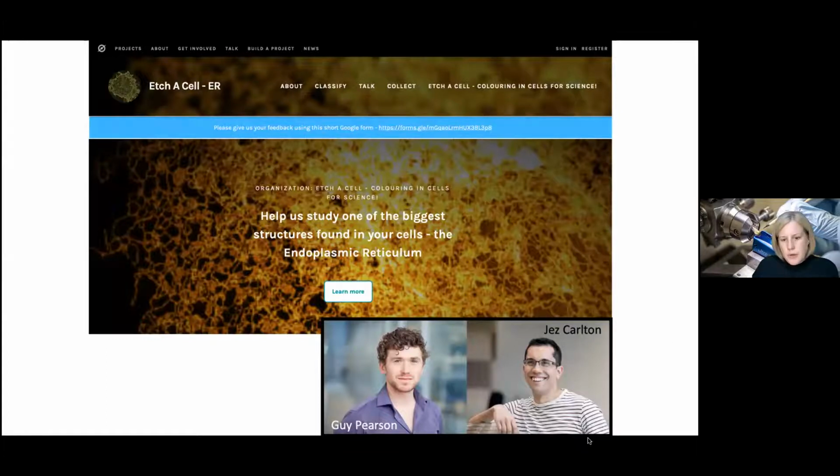So this is working with Guy Pearson and Jez Carlton. I think I said that. And if you'd like to have a go, this is actually using their real data, from a real project, looking at how organelles divide in mitotic cells.